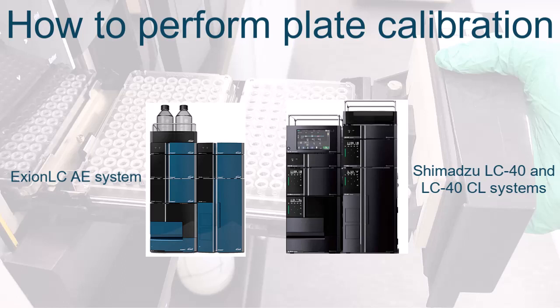In this video, we will show how to perform a plate calibration on Exeon LC8E, Shimadzu LC40, and LC40CL systems. We demonstrate the calibration procedure, also referred to as teaching, using a Shimadzu LC40 system.